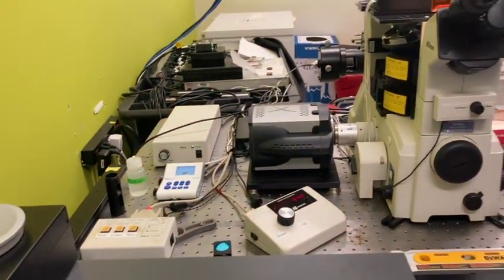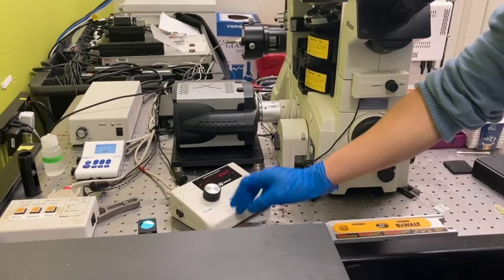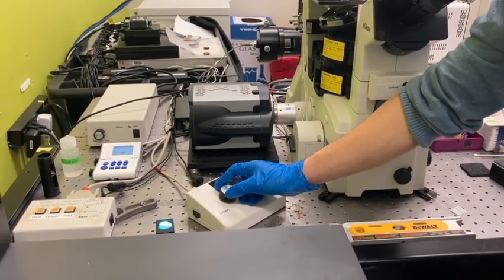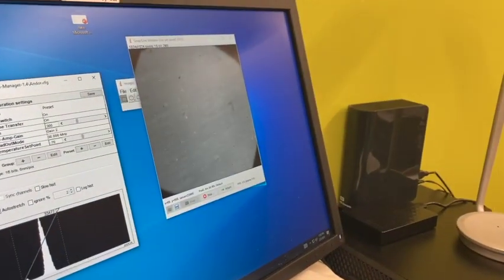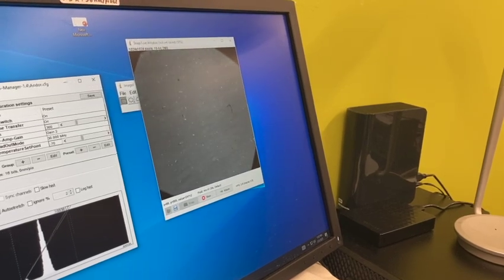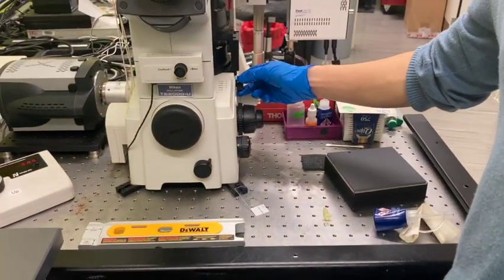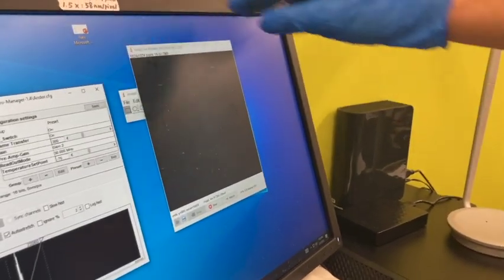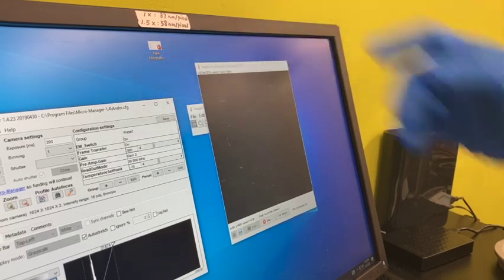Regardless of whether there's nothing in your sample, you still know there's my surface. And here is easy. This is going down and going up, so no big thing here. So once you find your surface here, then you don't want the back edge around, and you can switch back to 1.5, and I think we normally do 1.5x. And the difference is, at 1x we have 87 nanometers per pixel, and 1.5x is 58.